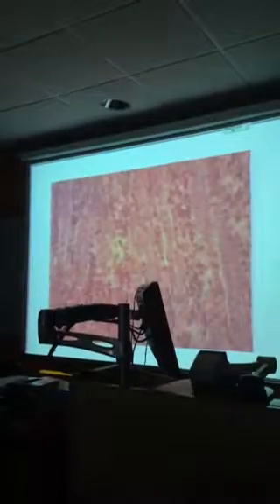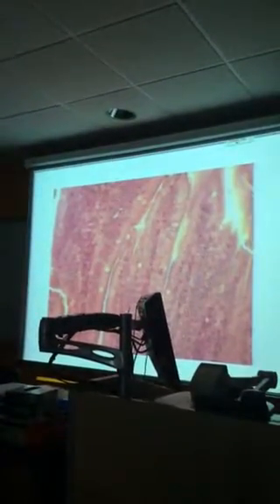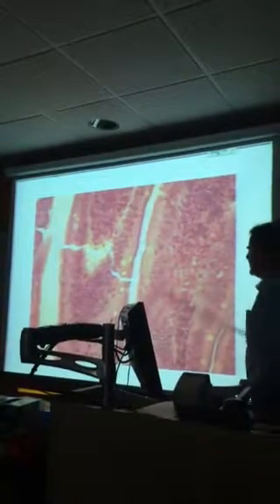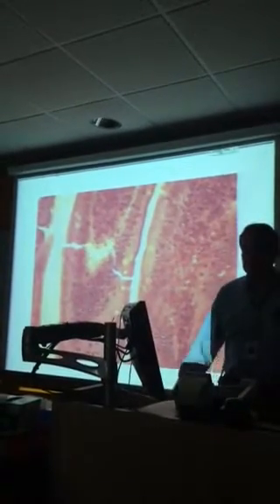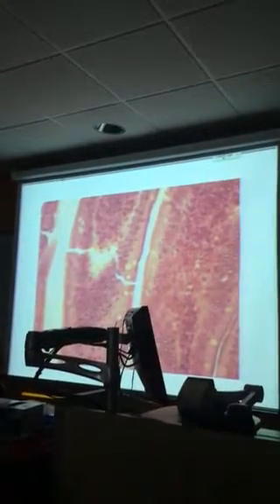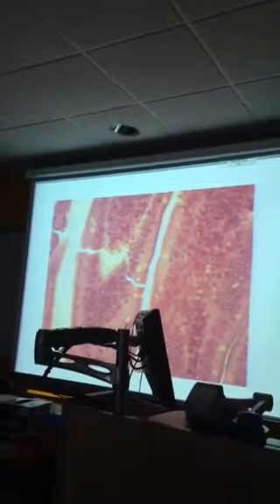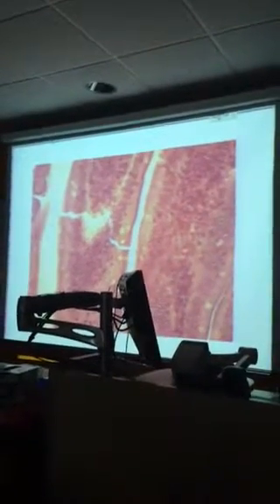Something else I'm going to show you. Okay, again within each villus, as I said, you've got a blood capillary network, and you've got a lacteal, and then you've got this connective tissue. What's a connective tissue? What's it known as? Two words. Lamina propria again. So lamina propria. Okay. Loose connective tissue deep to the epithelium in the mucous membrane.